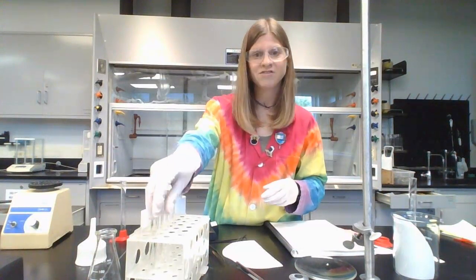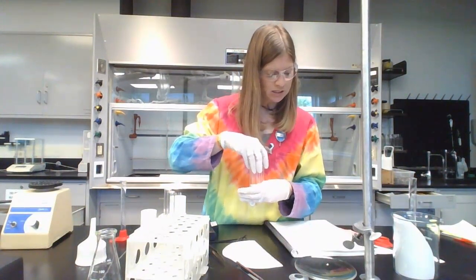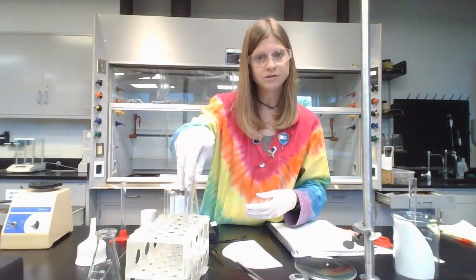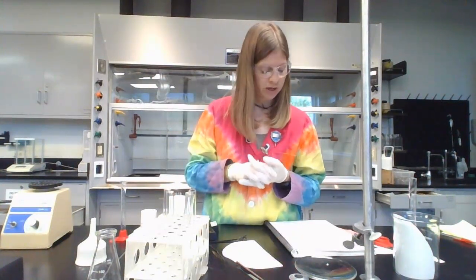Your test tubes that have the colors that you did the FeCl3, they have their own waste container. There's an iron waste container where those go into. But so there's the iron waste container, and then there's pretty much the everything else. Nope, I lied. Iron waste container, aspirin, like the solid waste container, and then an everything else waste container. Nothing goes down the drain, but everything goes into one of those 3 waste containers.